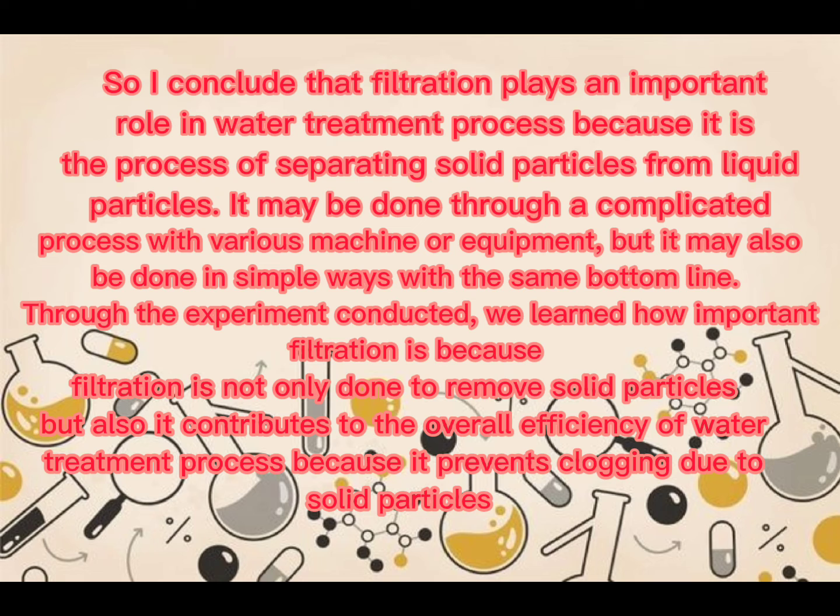So I conclude that filtration plays an important role in the water treatment process because it is the process of separating solid particles from liquid. It may be done through a complicated process with various machines or equipment, but it may also be done in simple ways with the same bottom line. Through the experiment conducted, we learned how important filtration is, because it is not only done to remove solid particles, but it also contributes to the overall efficiency of the water treatment process because it prevents clogging due to solid particles.